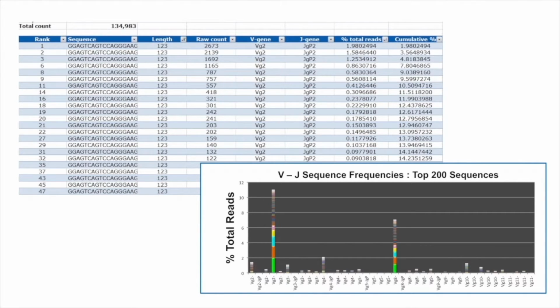Now, sometimes it is very difficult for patients when you're tracking these clones while they are actively receiving therapy. You may have differences in 1 or 2 bases and maybe 3 bases, which is the effect of the chemotherapy. And you can see this arrangement in here. This is actually exactly the same clone. You can see it here, 123 base pairs, but in none of them is actually more than 2.5%.